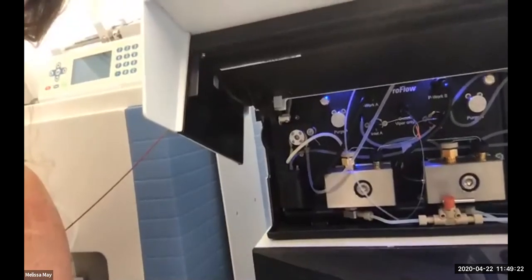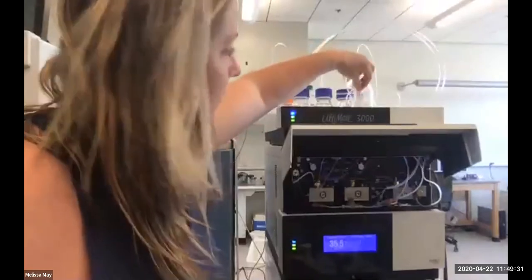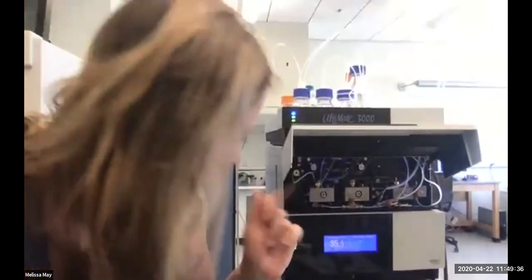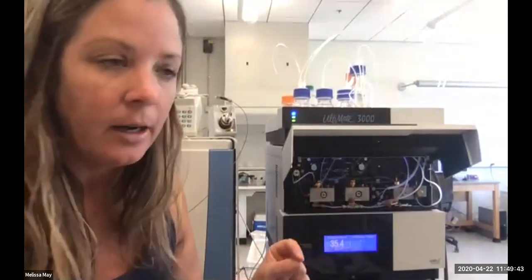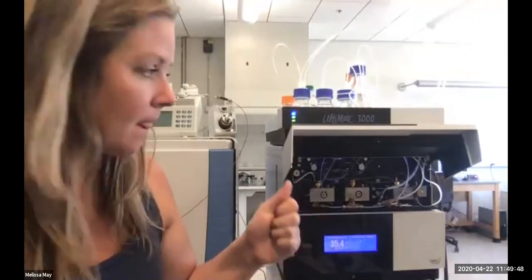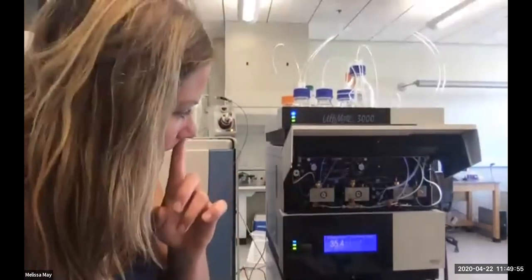So you can see that that little wheel starts spinning and it's pumping our rear seal wash through the system. Because this line that's coming out of our methanol bottle is really flimsy, sometimes it does get bubbles in it. And so it's necessary to just cycle that a couple of times. So one other thing that you need to be aware of is you can see that there's a lot of connections in here. It doesn't happen very often. Usually it's if you're switching things, but you can get leaks in these different fittings because over time they'll loosen. Everything should be finger tight is what they tell you with these Viper fittings.